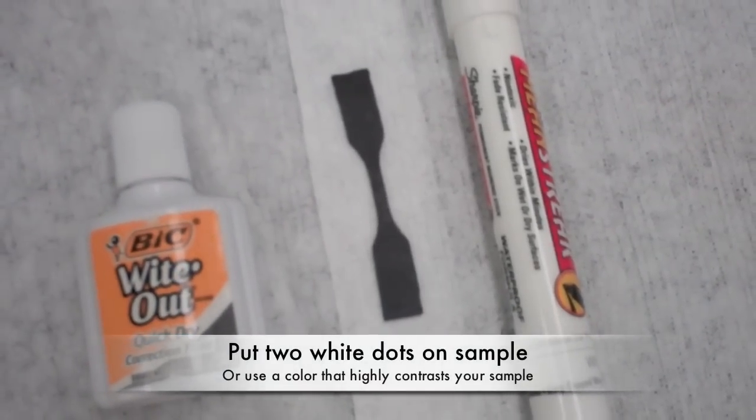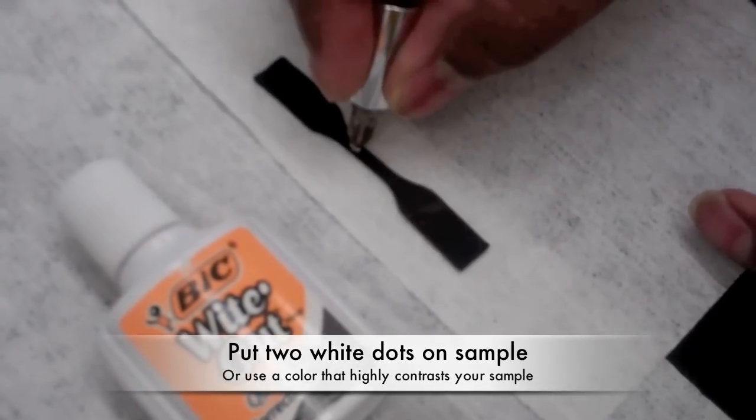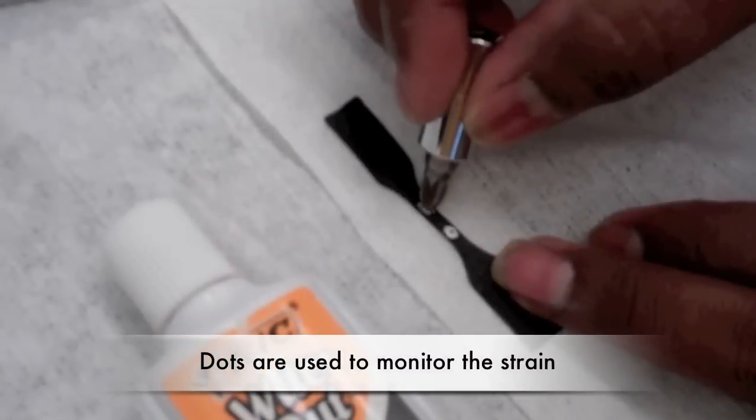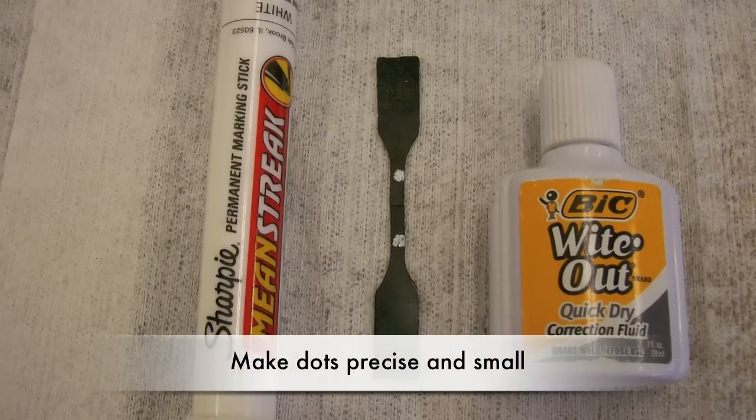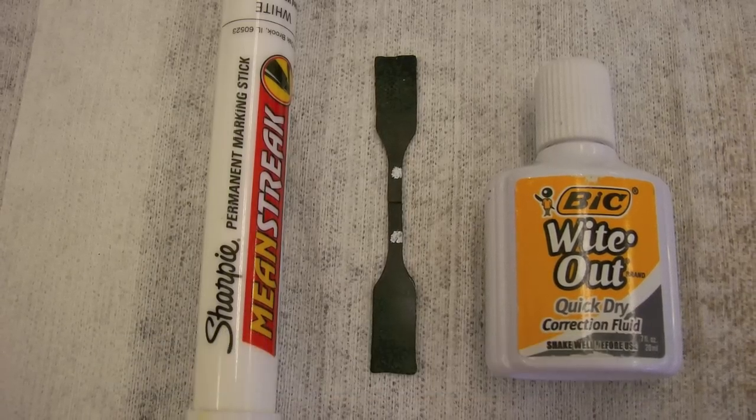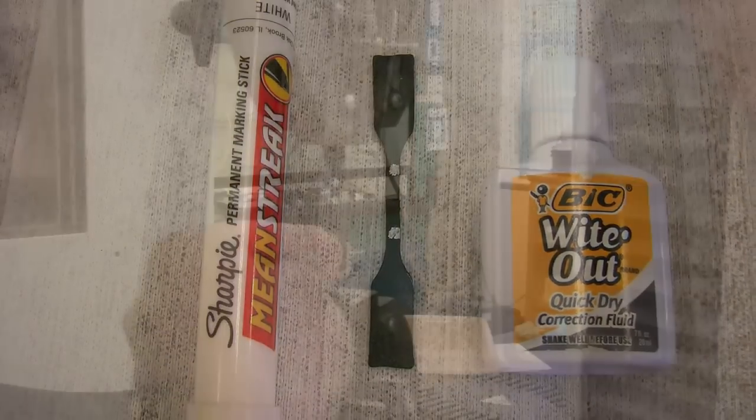Take your sample and put two white dots on the gauge length using a white marker or paint. The distance between these dots will be automatically measured and monitored by the video extensometer. Make sure the dots are very precise and relatively small so the software can easily recognize and monitor them during the experiment.